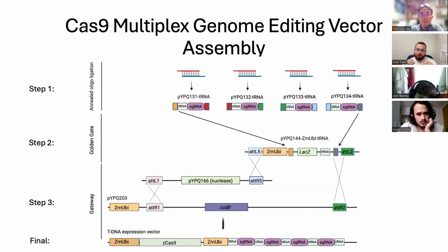However, as mentioned, if it's not working well for you, I would test out the polymerase 3 strategy. Just make sure you design your guide RNAs adequately, with the U3 and U6 promoters, beginning with adenine and guanine, respectively, as you're designing your guide RNAs. So that would be what I have to say there. Hopefully that addressed your question.